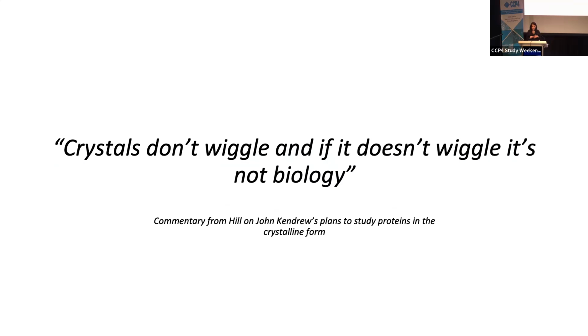Crystals don't wiggle, and if it doesn't wiggle, it's not biology. But as we all know, crystals do wiggle, and proteins in crystals wiggle quite a lot. That's why we have thermal B factors. That's why sometimes we have missing parts of our structures. Proteins in crystals are quite dynamic.